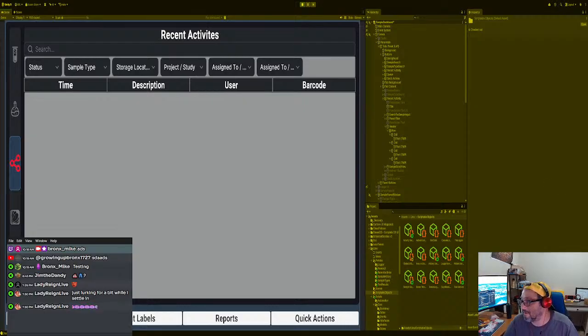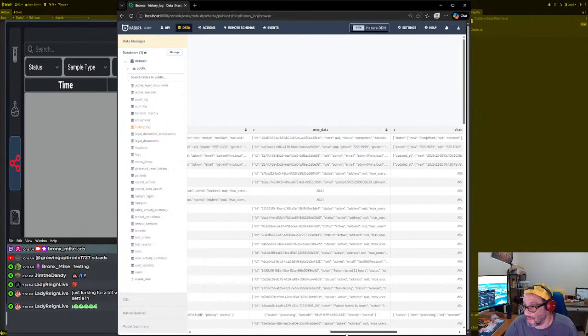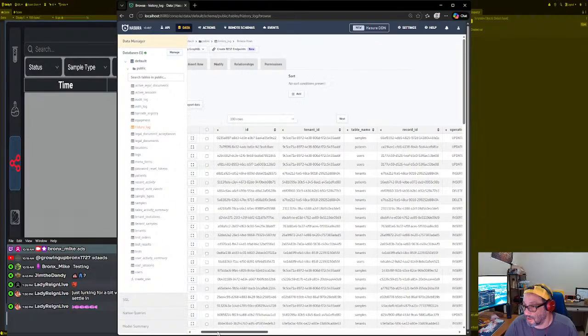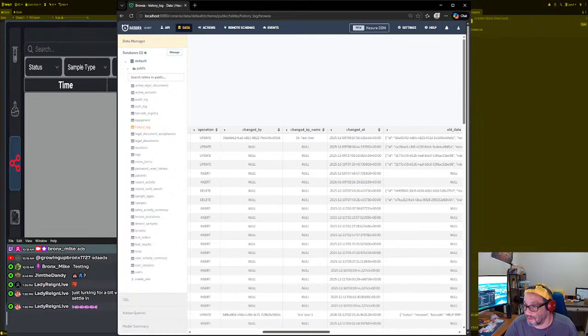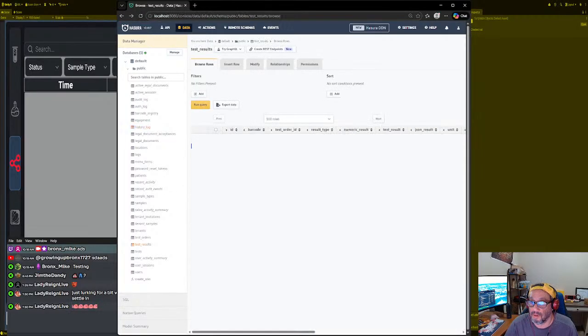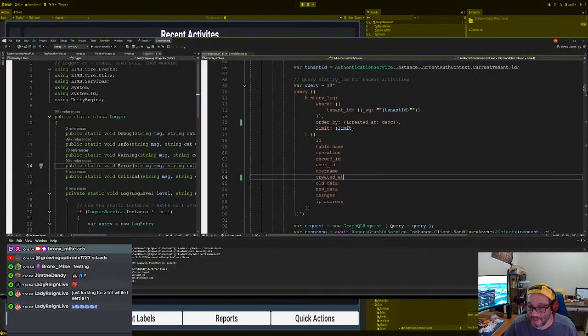Okay, we got here user ID. Man, I gotta make sure I do all those. User ID, patient ID, record ID, tenant ID, table name, record, changed by. I'm gonna say changed by because we have a changed by. All right, cool. So we go back over here. We go back to it. What is it? User ID?